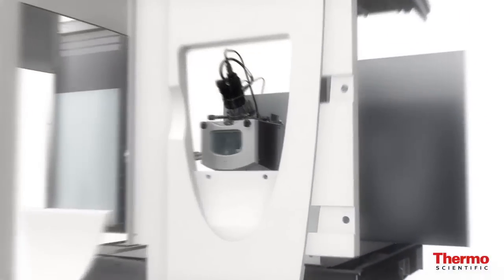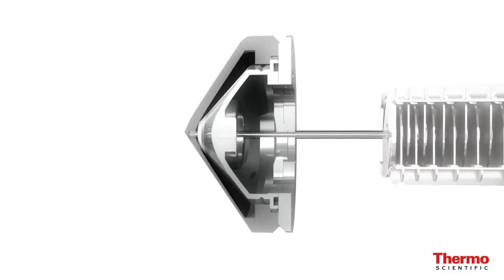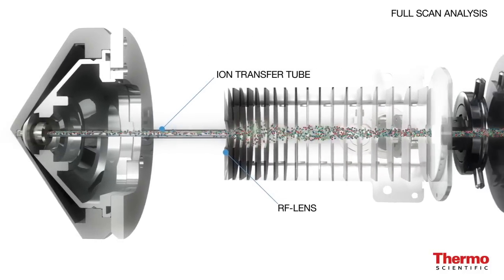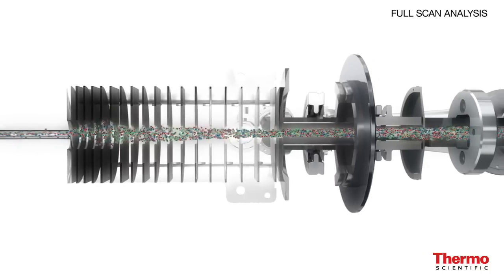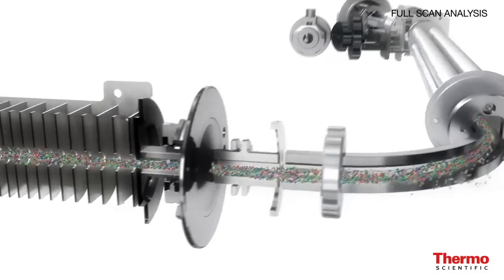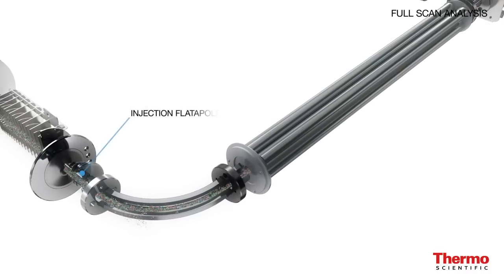We're using the Q-Exactive to replace what we used to do on a triple quad. In the past we would have a suite of multiple residues, up to 100 or 150, done by a triple quadrupole instrument. Of course, there are many more compounds of interest we would like to look at that would involve multiple runs on a triple quadrupole instrument. With the Q-Exactive we can do the top 150 that we would be mainly interested in.